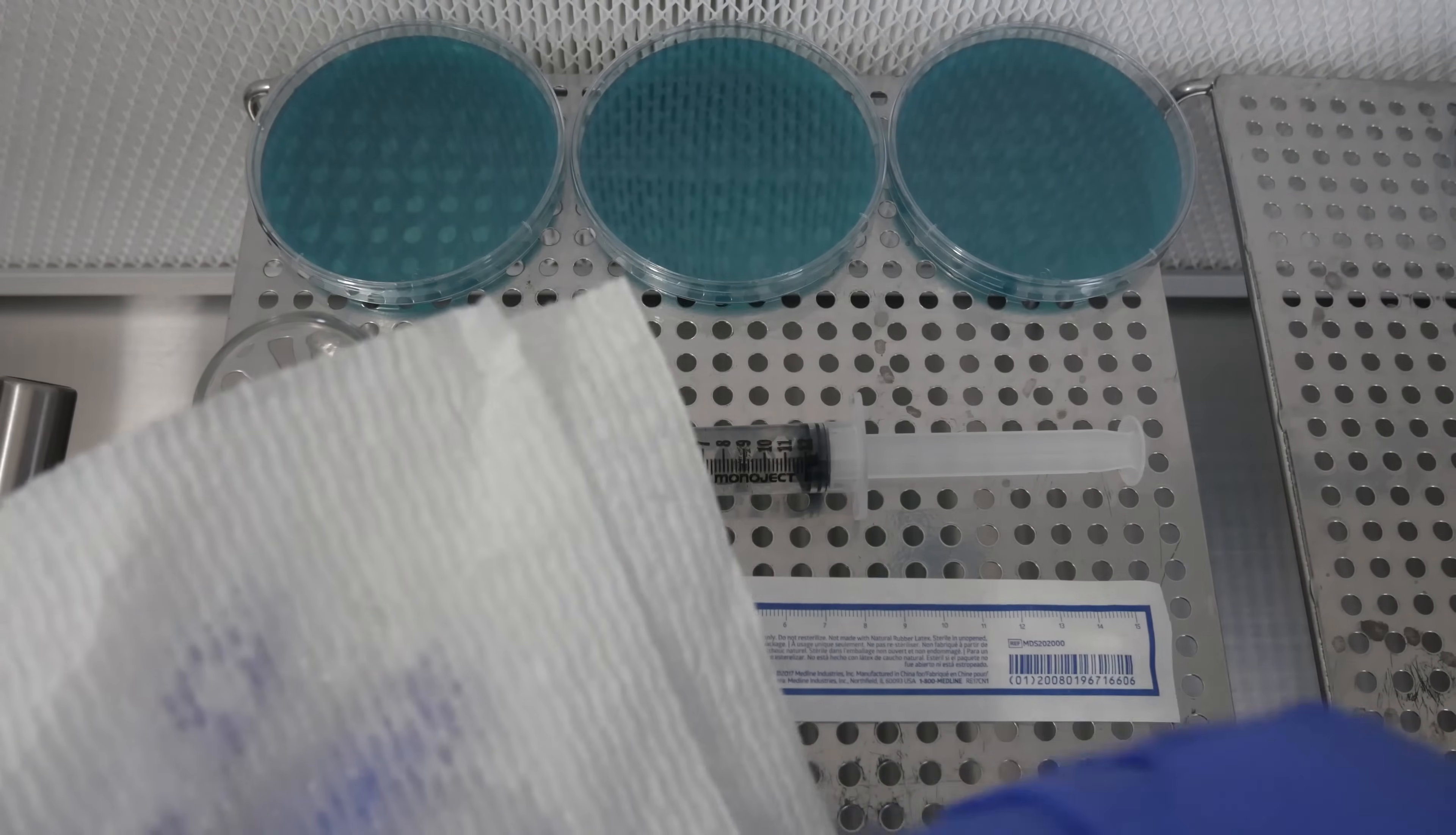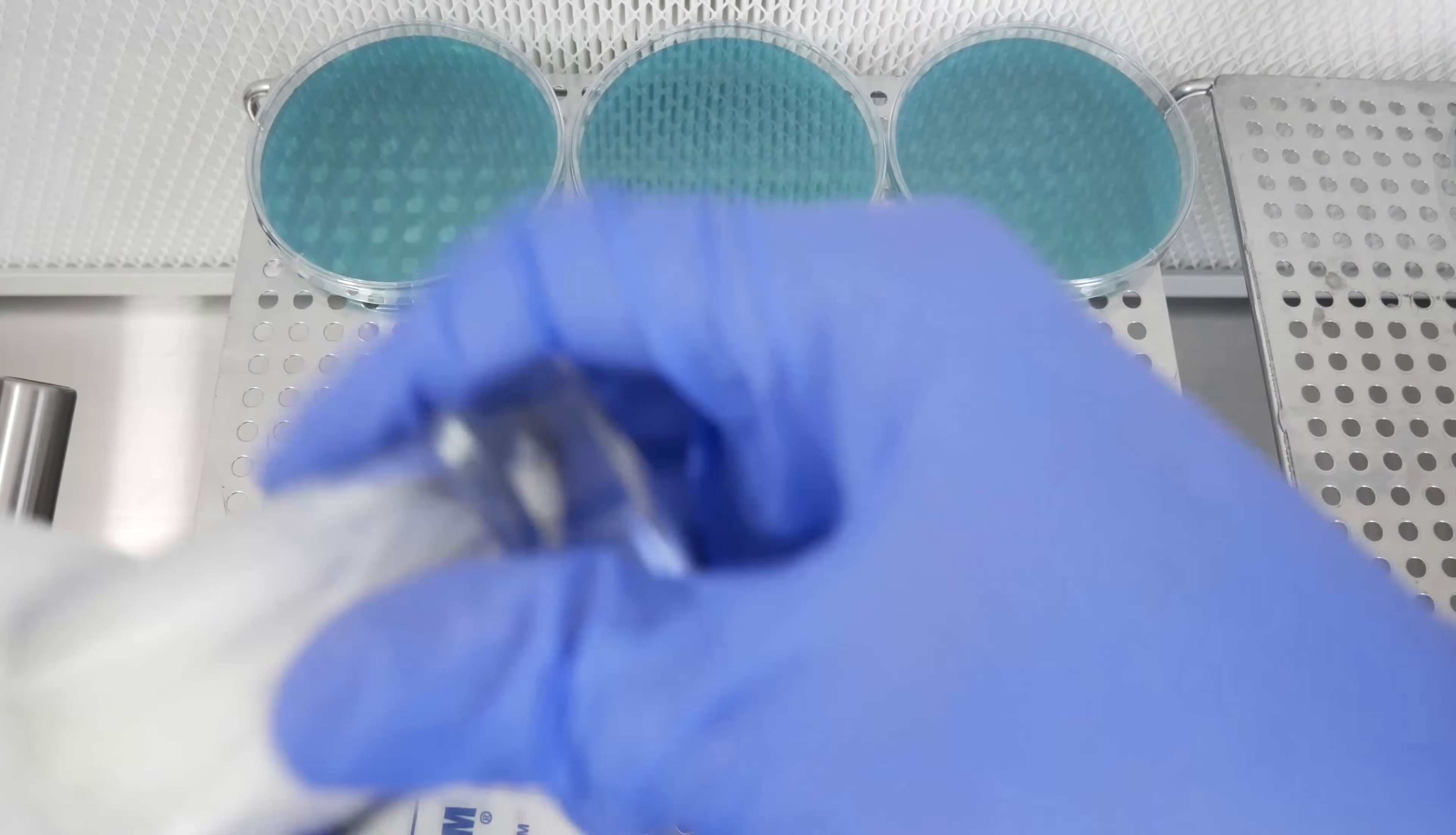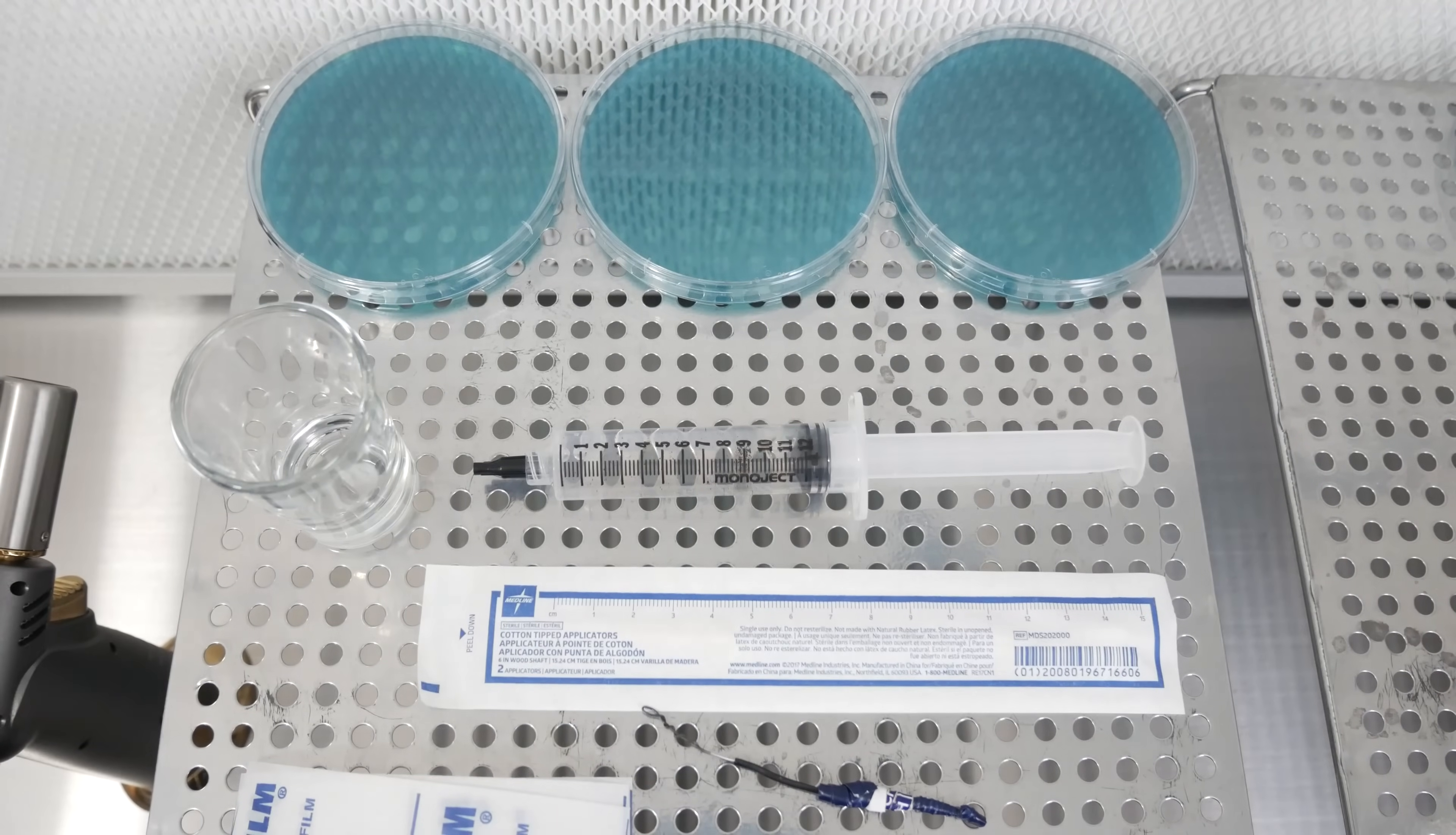Here I'm going to wipe down my inoculation loop and I have a little shot glass here I'm going to wipe down as well with the isopropyl alcohol. It's already clean but we're going to clean it up some more. It never hurts to be too clean.